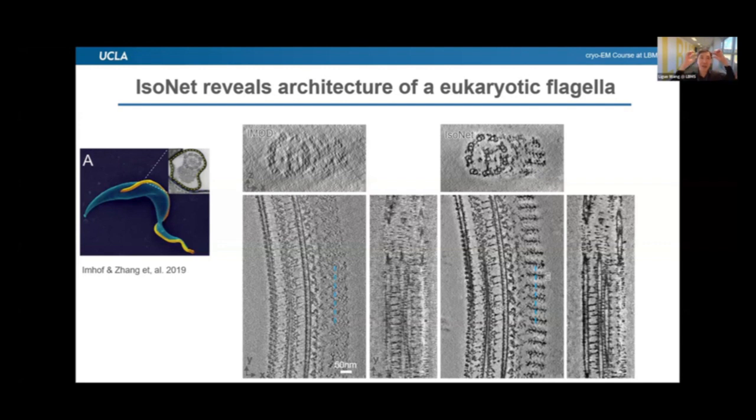Just like the bicycle, two sides are much better than the top and bottom. Yes, you can definitely do it without denoising, but typically denoising helps to visualize. If you don't do denoising, you still can recover the information, but with denoising the structure looks better. So my question is really, if we don't do the filling of the missing wedge information, just do denoising, how will that look?